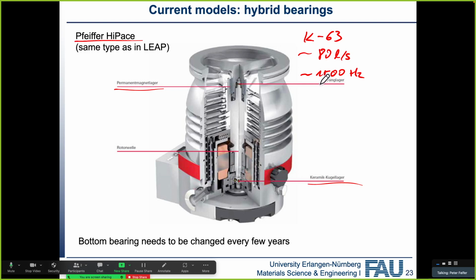So this brings us to the biggest downside of turbo pumps, and that is that they are vibration sensitive. If you have a turbo pump on a device that sits on a table, and I do this, what will happen is you will hear very bad noises from the turbo pump, and if you're unlucky, the turbo pump might even blow up, just because the rotor will start touching the stator and then be slowed down very quickly.